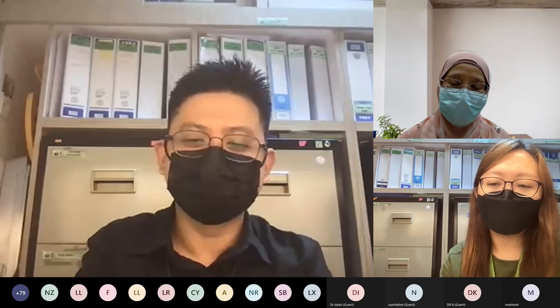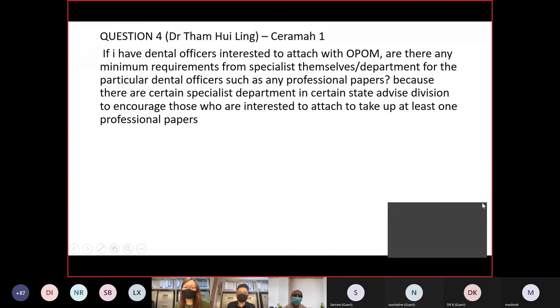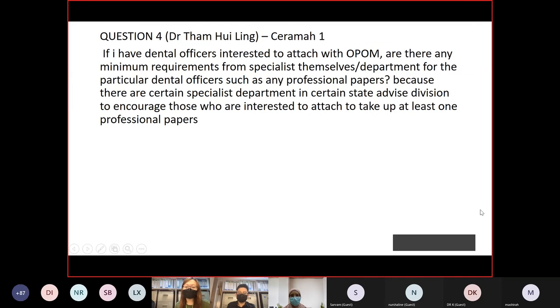But if you are transporting through air or even by bus, I think you need that absorbent material in between, because if there is any leakage of formalin, it will be absorbed by this material. We had one case last year. Yeah, we had very bad leakage.